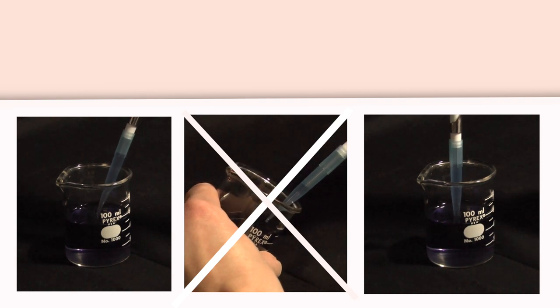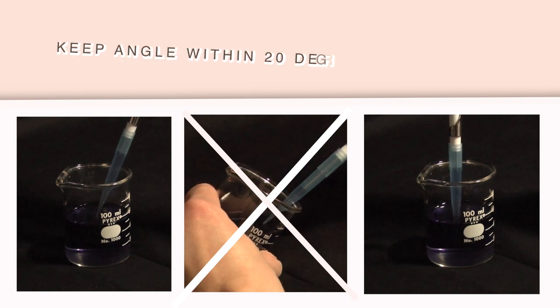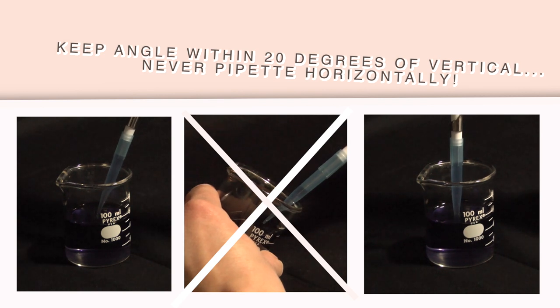In order to accurately draw the liquid into the pipetter, it is important that you keep the angle within 20 degrees of vertical. Never pipette horizontally.